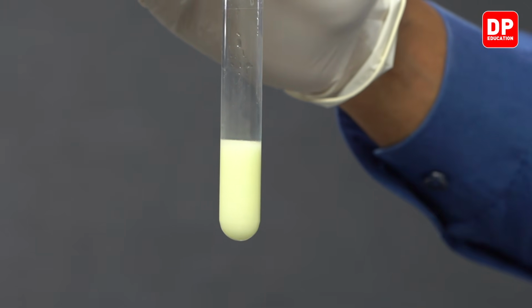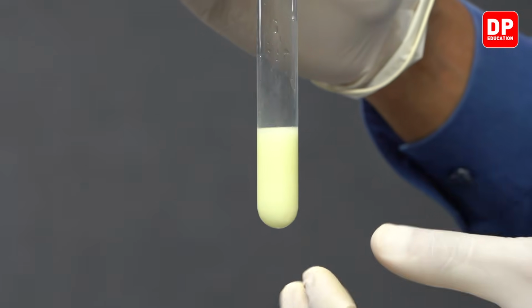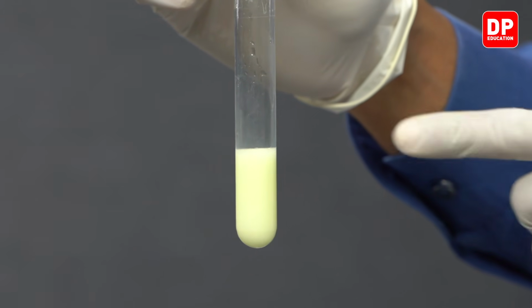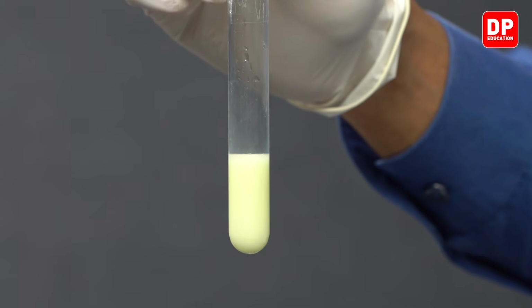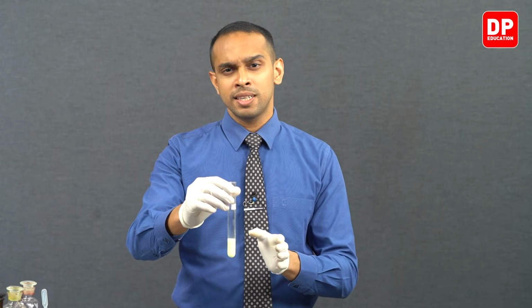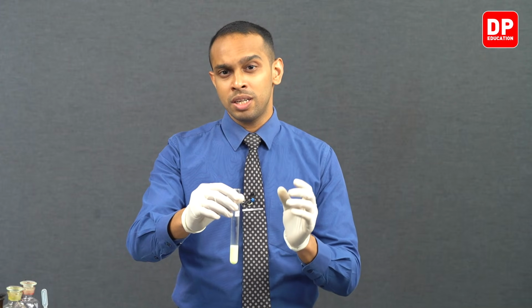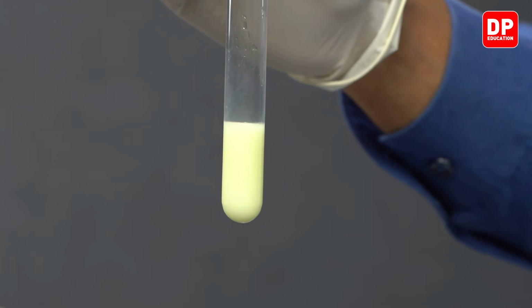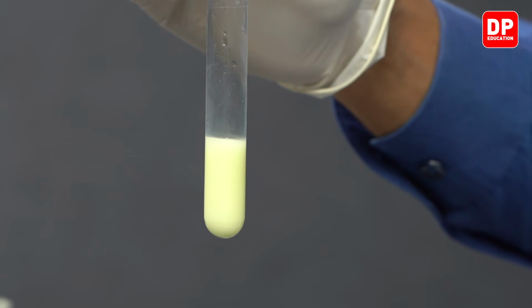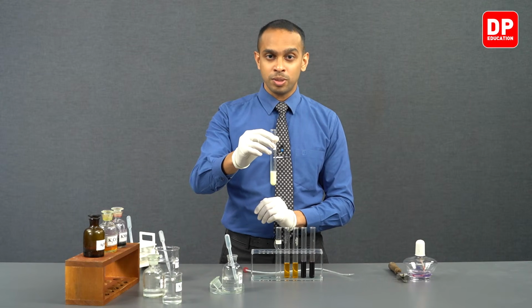If you mix it, you can very clearly see the yellowish precipitate, or we can see there is quite a lot of colloidal sulfur formed here, and now the solution is completely filled with solid sulfur that is produced, and it is dispersed throughout the aqueous medium. So therefore we can observe the yellow color very clearly. When solid sulfur is produced in very small quantities, it is just going to turn the solution milky, because the amount produced is very little. However, if you have produced quite a lot of colloidal sulfur, you are going to observe a yellow color here. So this is the observation.